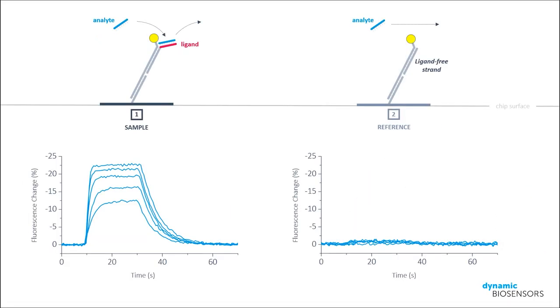Because conventionally many users preferred the signal to go up during the association phase and go down during the dissociation phase, the y-axis has been inverted here. Before we discuss the fit analysis in more detail, let's briefly compare the raw signals measured from the sample spot and the reference spot. As we can see from the flat lines, no interaction occurred on the unmodified reference spot, so we can conclude that the interaction was a specific binding event between analyte and ligand.